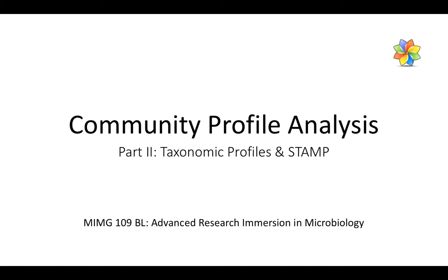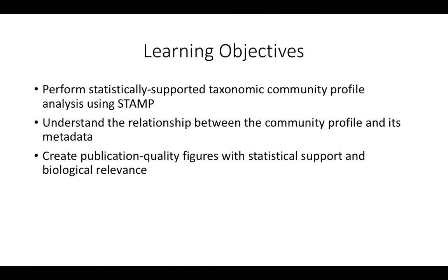Hello, and welcome to this tutorial on community profile analysis as made for MIMG 109BL at UCLA. This second video is on taxonomic profiles and STAMP. By the end of this video, the student will be performing statistically supported taxonomic community profile analysis using STAMP, will understand the relationship between the community profile and its metadata, and be able to create publication quality figures with statistical support and biological relevance.